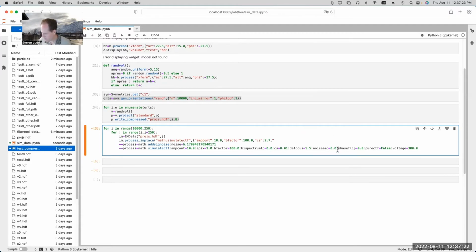Yeah, so if I have phase flip set to 0, that means that it won't actually be flipping the phases. So if we process this data following the standard EMAN pipeline, that means that we would want to skip the CTF correction part of the process. I think I'll go ahead and just make this a full processing pipeline. So we'll go ahead and say phase flip 1. So we're going to flip the phases, and then when we do the processing, we'll unflip the phases. I'm a little worried that I may not have used a big enough box size for this data, because it's filling pretty close to the edge of the box.